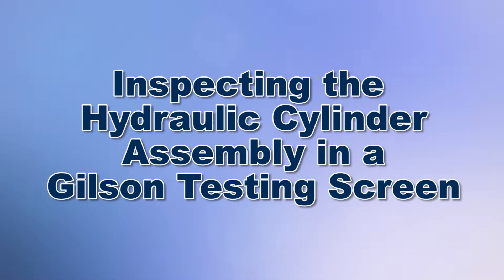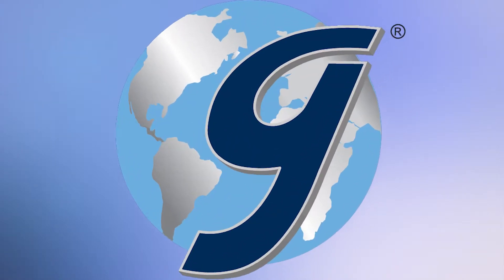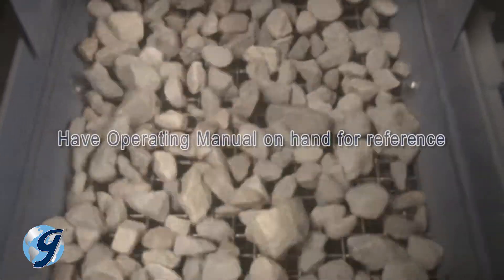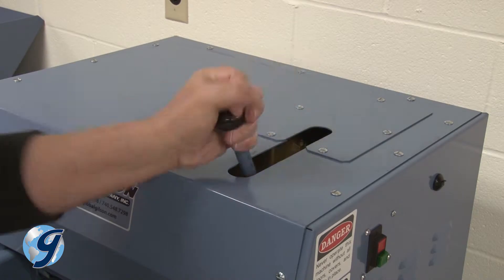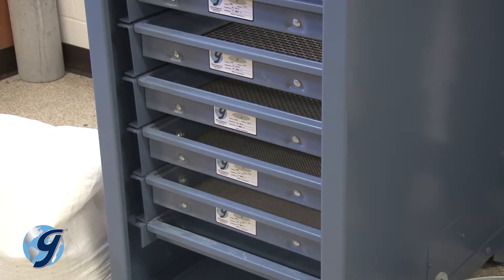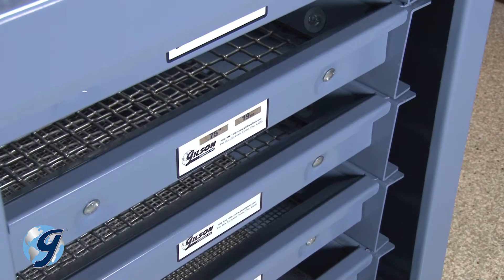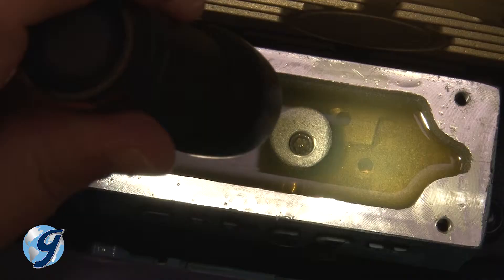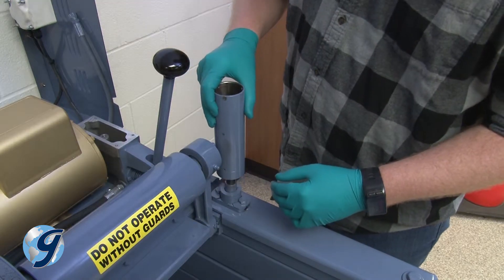Today we're going to inspect the hydraulic cylinder assembly in your Gilson testing screen. Gilson testing screens are rugged, tough machines that will provide years of service if installed and maintained correctly. On Gilson testing screens with hydraulic clamping, the hydraulic cylinders apply force to the clamp rods which secure the screen trays within the unit. If your machine loses clamping pressure during operation, or if you frequently need to add hydraulic oil, inspect the hydraulic cylinders for wear.